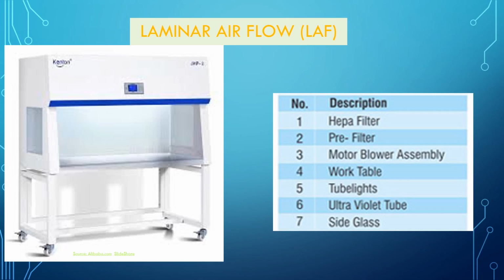This laminar airflow bench is fitted with a HEPA filter, that is high efficiency particulate air filter, which efficiently blocks all types of microbial organisms. Air is sucked into this filter and flows over the working area in laminar flow. This will ensure that the work area is free of microbial contaminants.